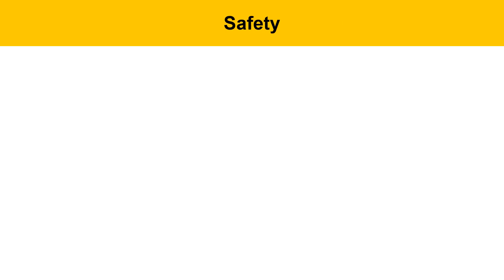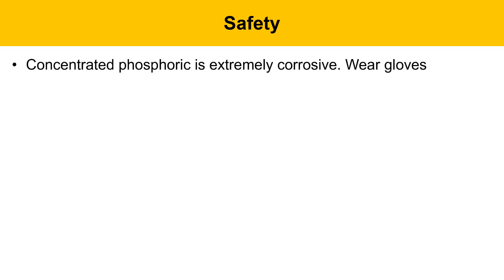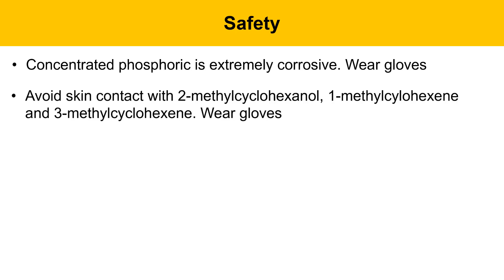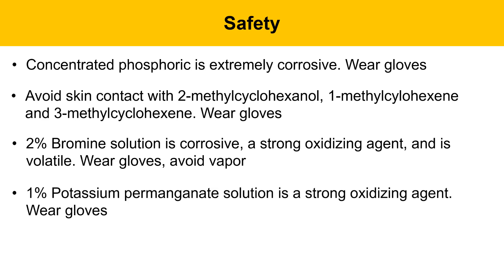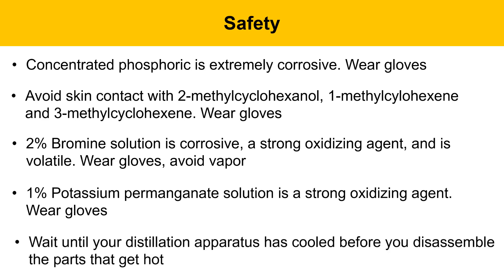There are safety concerns for today's experiment. Concentrated phosphoric acid is extremely corrosive — wear gloves. Avoid skin contact with the starting alcohol 2-methyl cyclohexanol and the alkene products 1-methyl cyclohexene and 3-methyl cyclohexene; wear gloves when handling them. 2% bromine solution is corrosive, a strong oxidizing agent, and volatile — wear gloves and avoid the vapor. 1% potassium permanganate solution is a strong oxidizing agent; wear gloves when handling it.